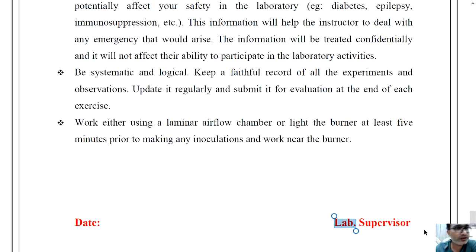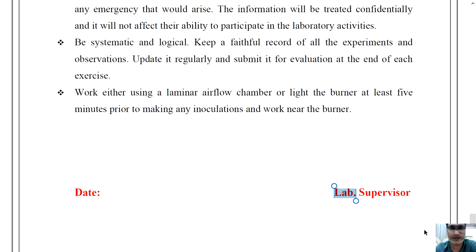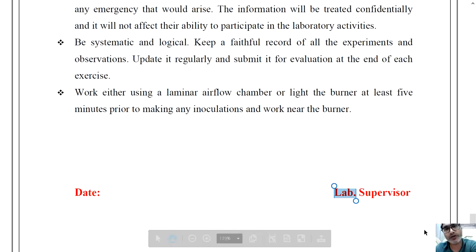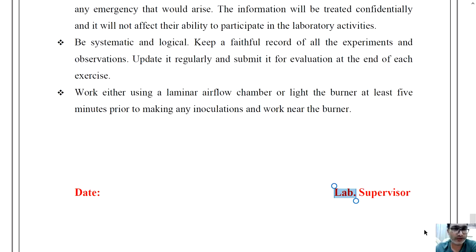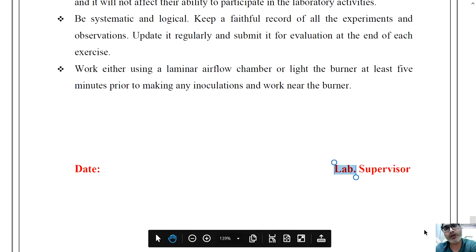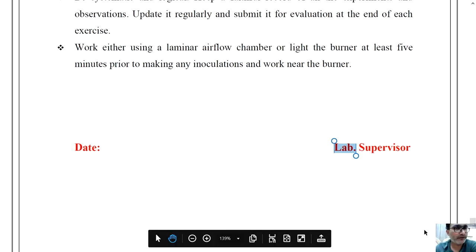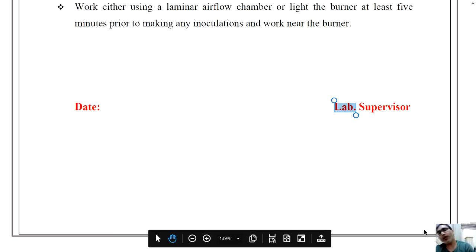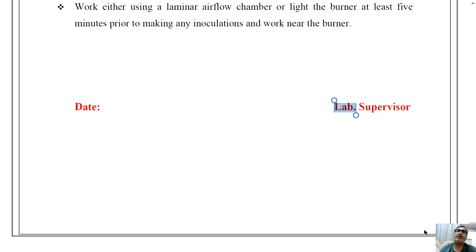The information will be treated confidentially and will not affect your ability to participate in lab activities. Be systematic and logical. Keep a faithful record of all experiments and observations, update it regularly, and submit it for evaluation at the end of each exercise. Work either using a laminar airflow chamber or light the burner at least 5 minutes prior to making any inoculations and work near the burner. These are all the guidelines and safety precautions you must follow when working in the microbiology lab.